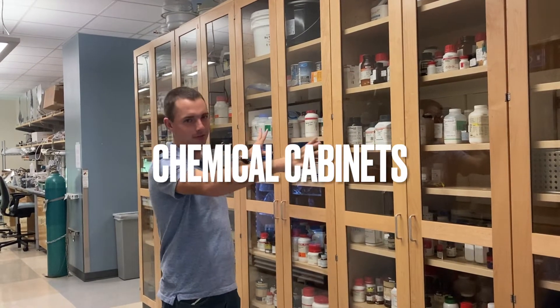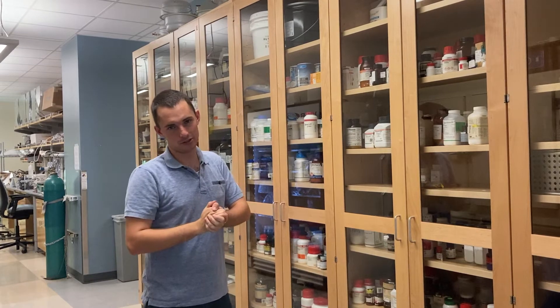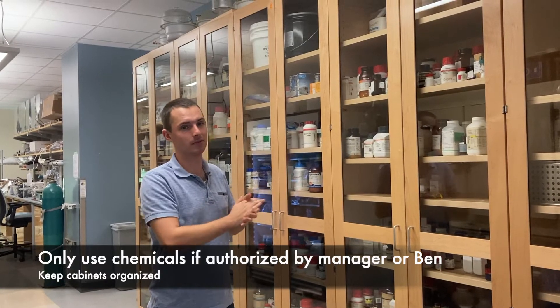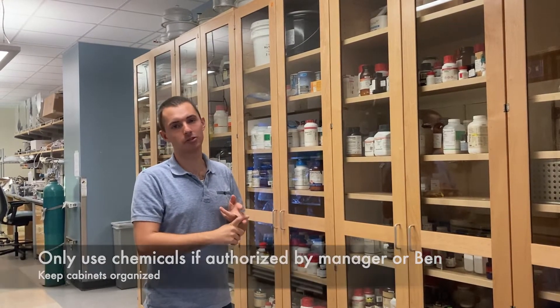These cabinets are full of chemicals, put there in an orderly and systematic fashion. If you take one out, please put it back in the same spot so someone knows where to get it next time. You shouldn't be needing to grab any chemicals unless a manager or Ben asks you to do so specifically.